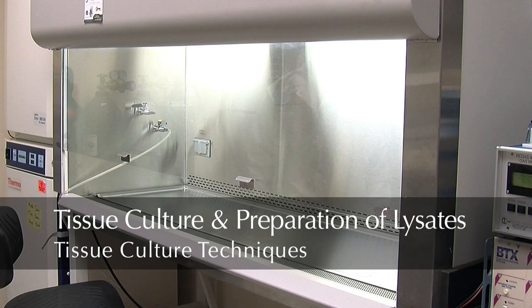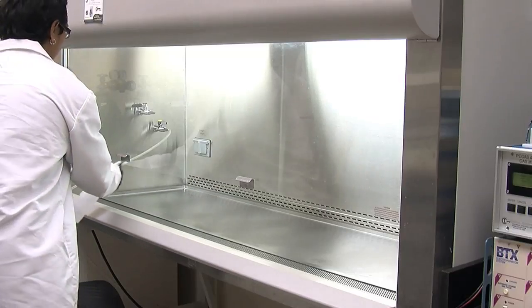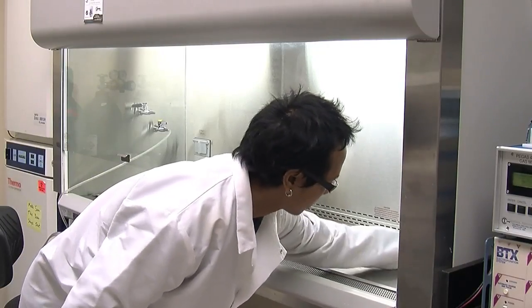Tissue culture and preparation of lysates. The first thing is to clean your gloved hands, the inside of the culture hood, and all instruments with an antiseptic. We use 70% ethanol.